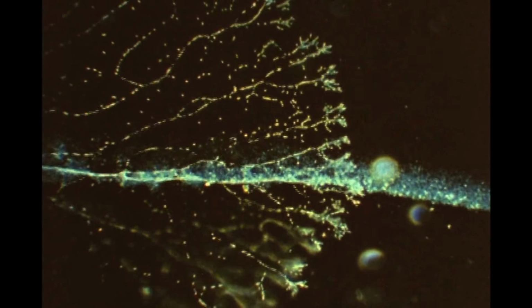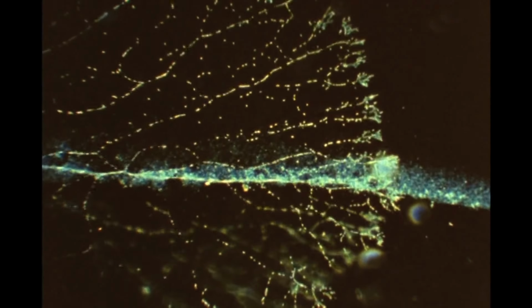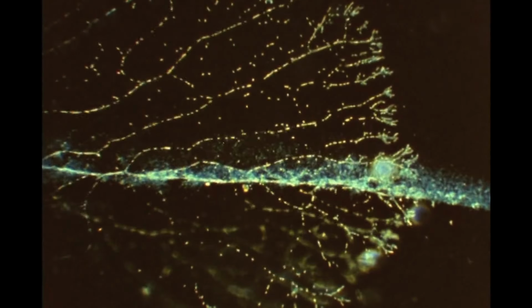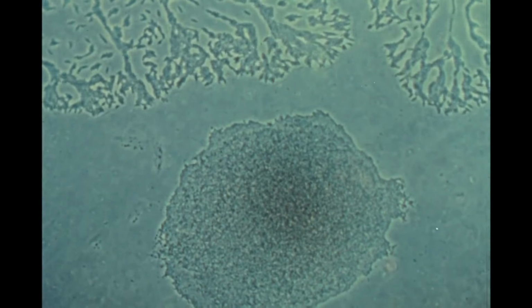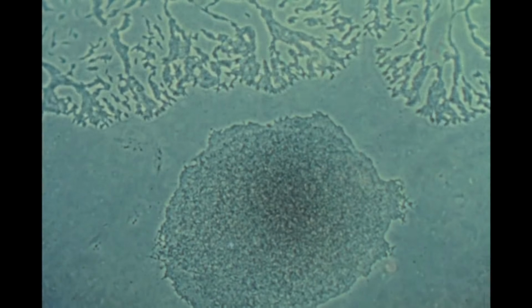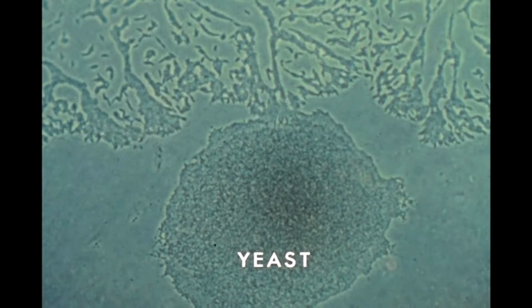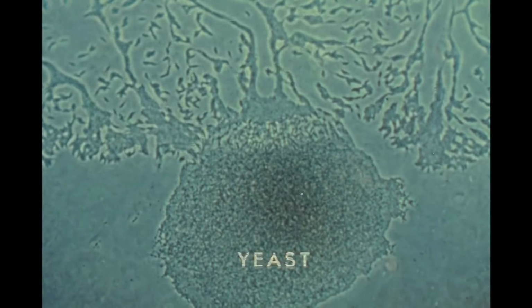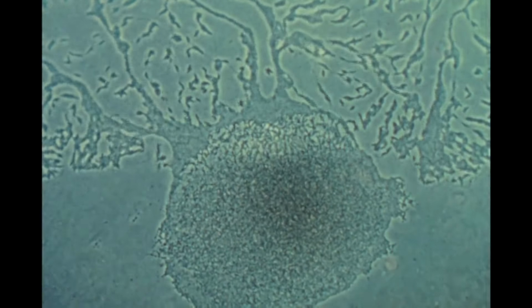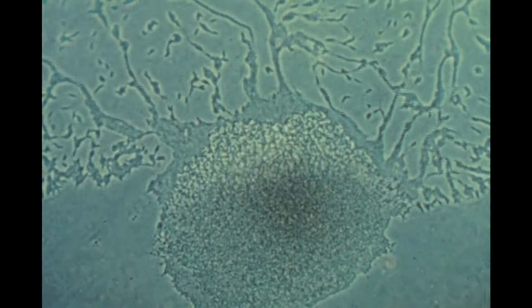Cell movement in an expanding colony is generally along roughly radial strands. But movement within the colony is altered after marginal contact has been made with food material, such as a concentration of yeast cells. The Labyrinthula cells stream toward the source of food.